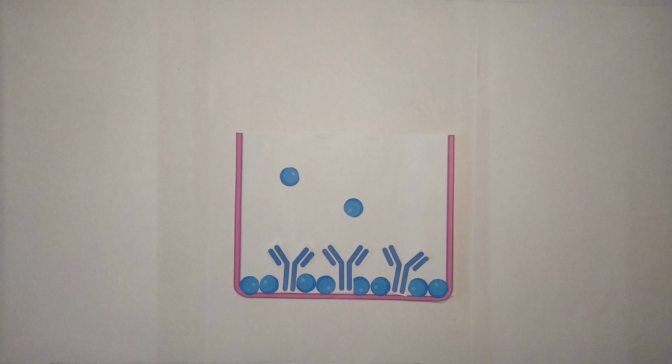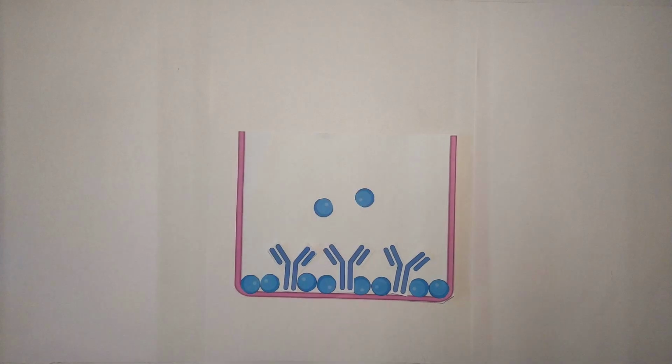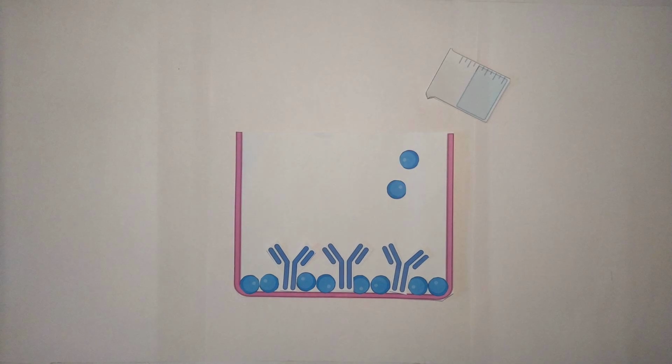We are going to use BSA as a blocking agent. This step is very important as it prevents false positive results. The wells are then incubated at RT for 1 hour. The wells are then washed with distilled water to remove excess blocking agent.